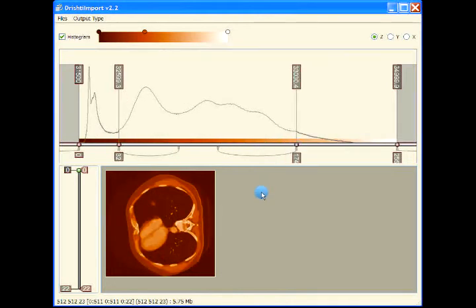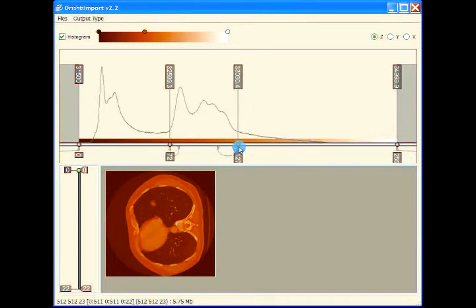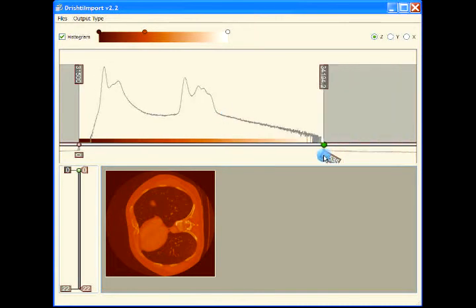This is a way of increasing the contrast in your data, especially if you want to go from 16-bit or 32-bit to say 8-bit or 16-bit. Now these are the mappings for changing from your 16-bit data to 8-bit data. Now if I want to keep it as 16-bit, then you can change your output type to 16-bit and your markers will change here. Because you are working on 16-bit, you need not change the contrast, but it's entirely up to you whether you want to change the contrast.